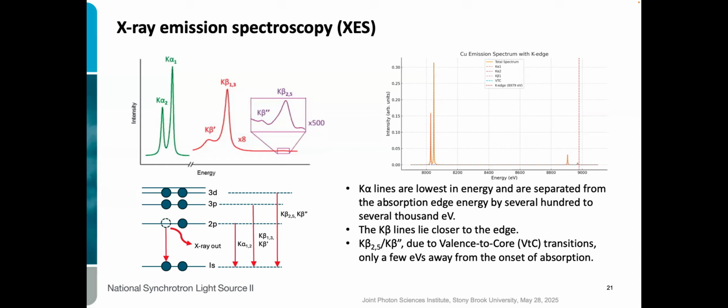And this is a kind of real intensity ratio and the distance. And I also need to say that if, after this lecture, you're enlightened and go, oh, I really want to do this, but I think I need to do the K alpha measure, then I will tell you, there is a certain cut of the silicon crystal, and I'm just throwing it out there, it's silicon 444 that works for this.